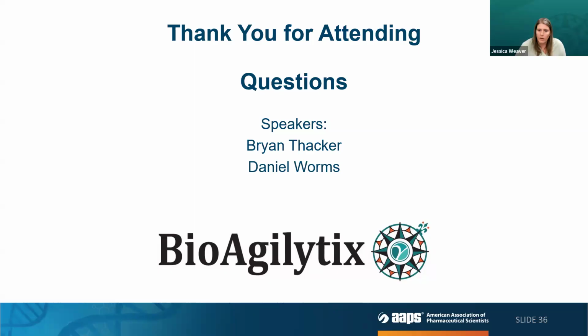All right, thank you for that, Brian. One more for you that's on the screen is, how do you optimize the LCMS method for intact ADCs versus characterizing release fragments or payloads? Yeah, so I think this is referring to the intact mass versus the peptide analysis.